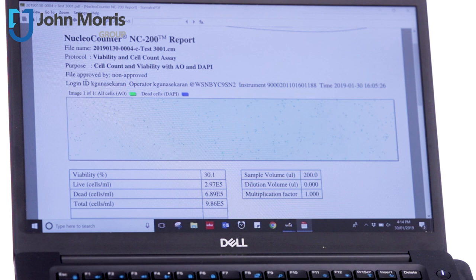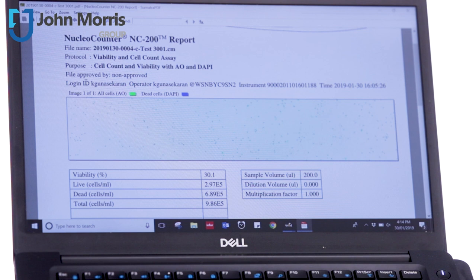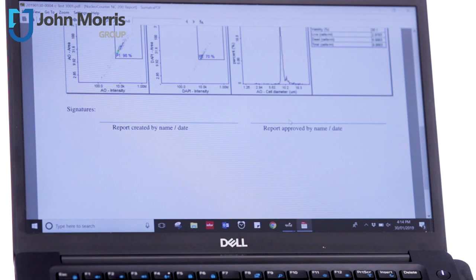You can see here, you've got all the data that you're after, including the operator, the instrument, the results, where your gates lie. And of course, you can sign and approve this report for true compliance.